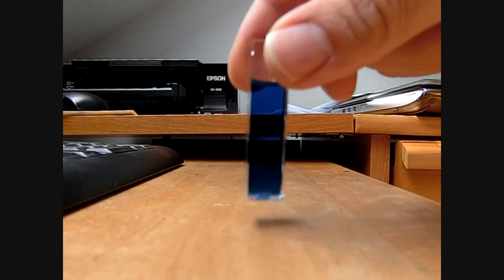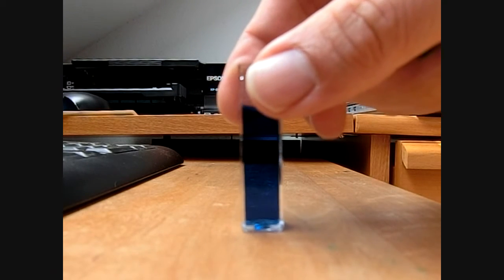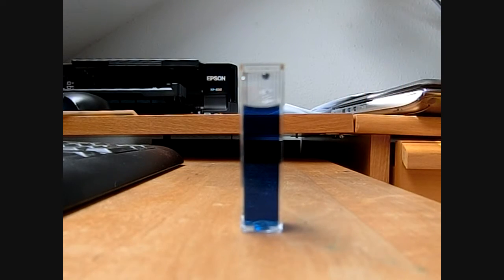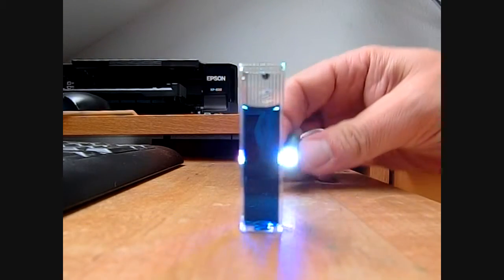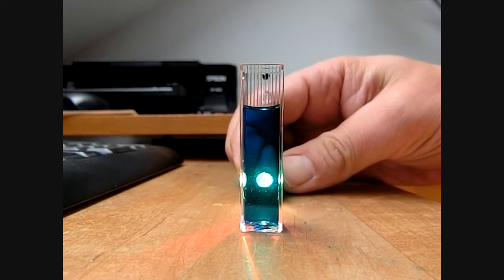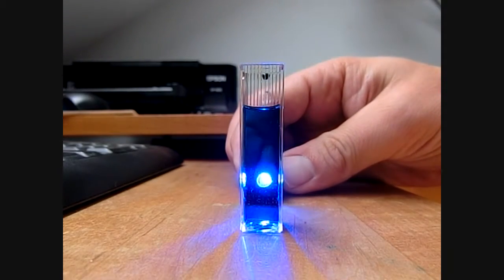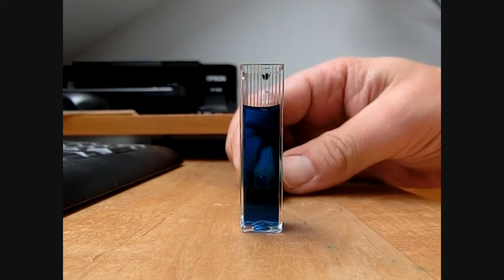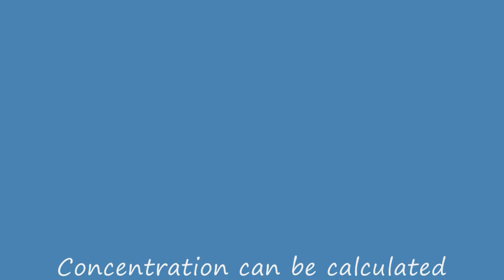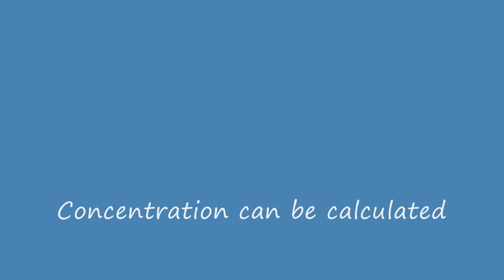However, if we now dilute the solution further, there is more light coming through the solution. One can say that much less of the light is absorbed by the solution. And you may see that there are still some colors that are more easily going through the cuvette than others.